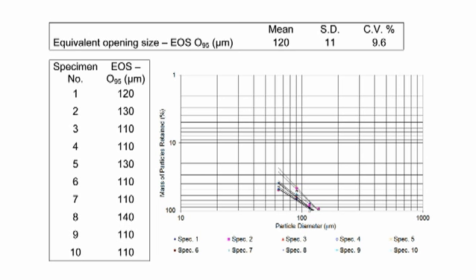This is the value known as O95. The O95 is reported to the nearest 10 microns. The 5 or 10 specimens are averaged to get an end typical result for that sample. The mean, standard deviation and coefficient of variation are reported.